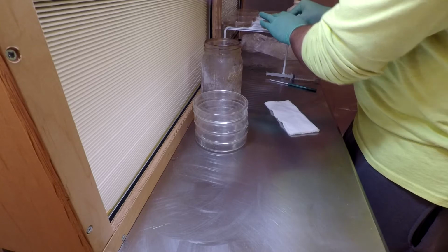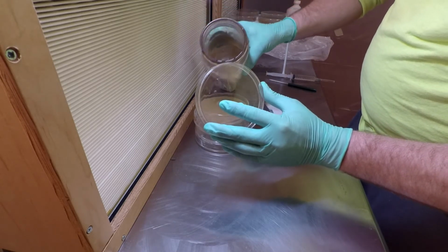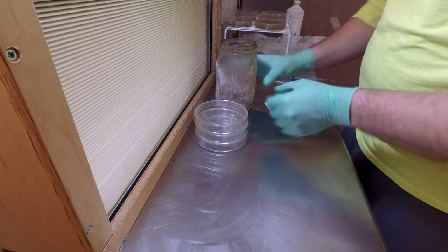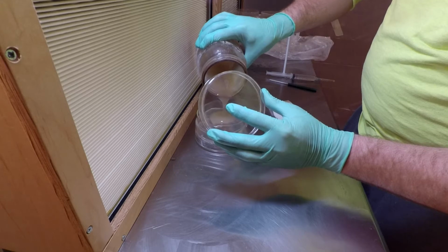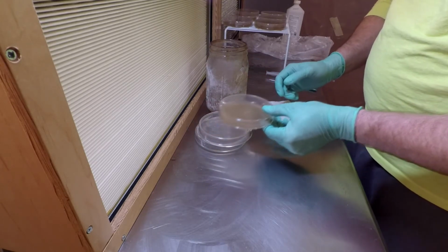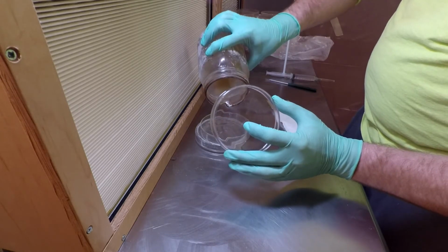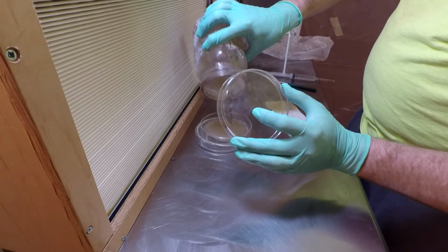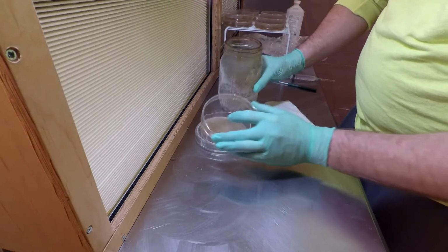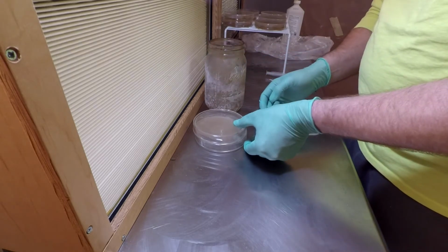Kind of a big blob fell into that one. You can see where it's almost so gelled. I'm probably not going to get barely enough to get this last dish. And you can see it's gelled, so can't get it any cooler than that.